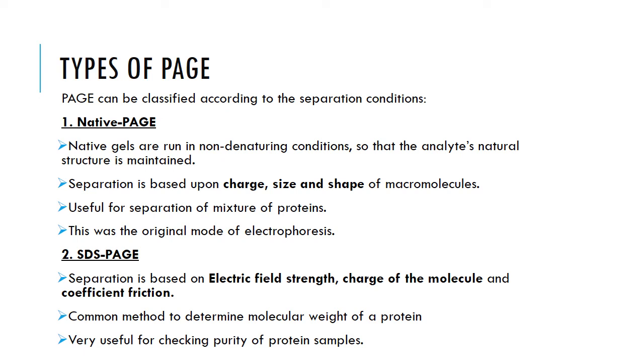Again, separation is based upon the charge, the size, and the shape of macromolecules when we're using this. They are also useful for separation of a mixture of proteins. This was the original mode of electrophoresis. Initially this was introduced, and then other methods were brought in place.